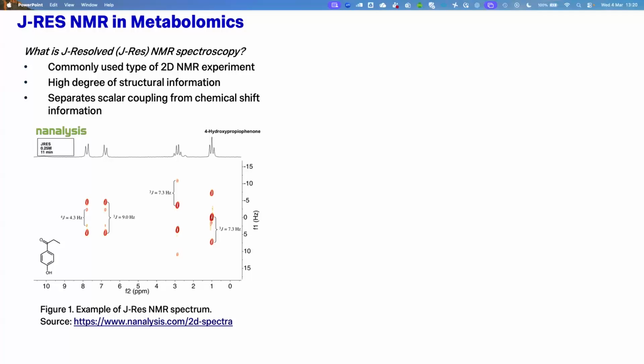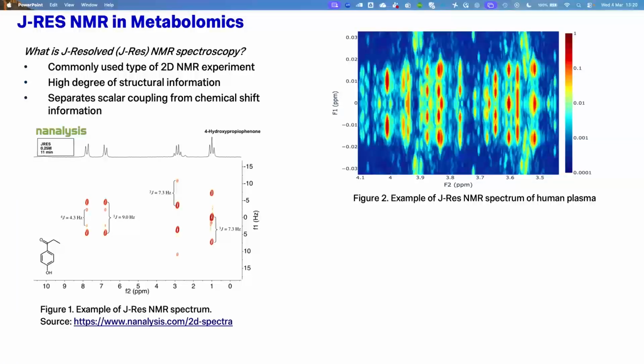So if we have a different small molecule with a different structure, we will get peaks in different positions. The other thing to draw your attention to is that it is symmetric about the 0 Hertz line on the y-axis there. So there's a y symmetry there, which is something that we then take on later to build into our deep learning network. So that's one molecule.